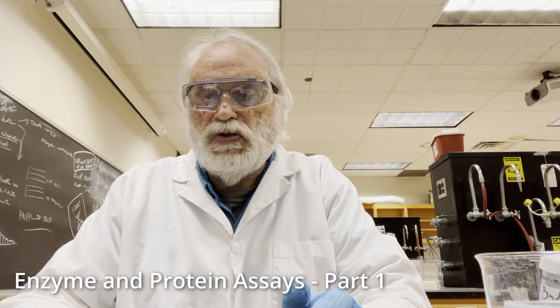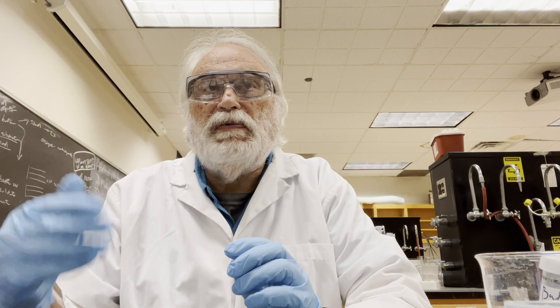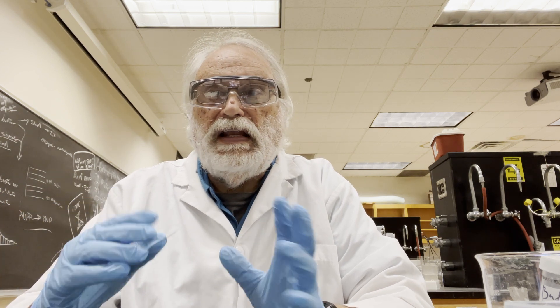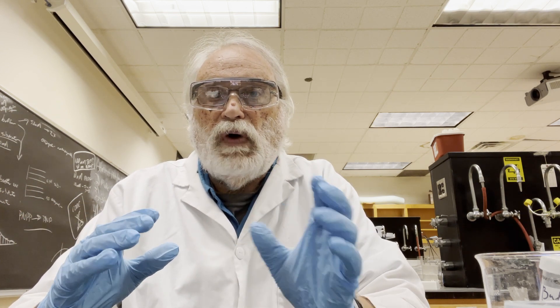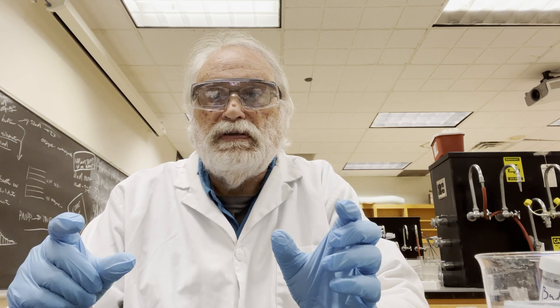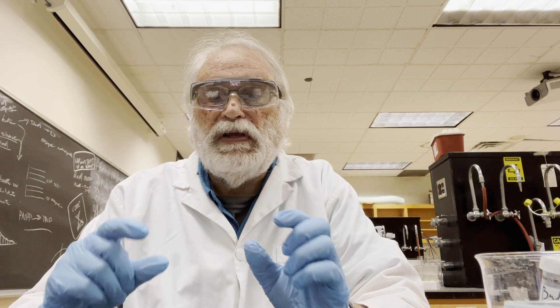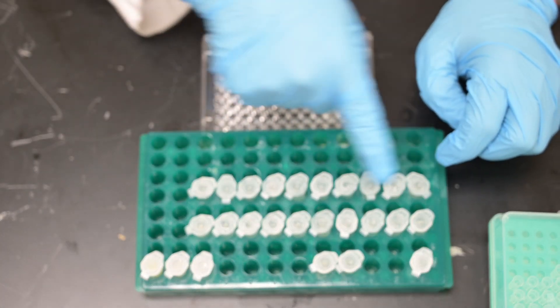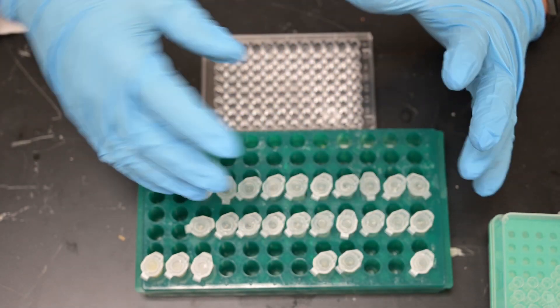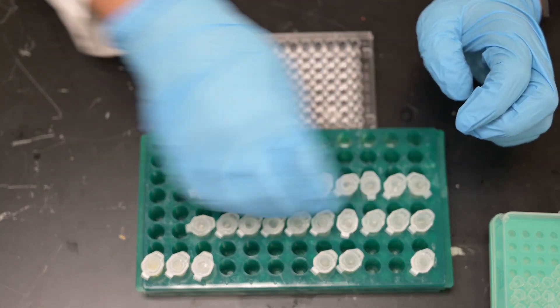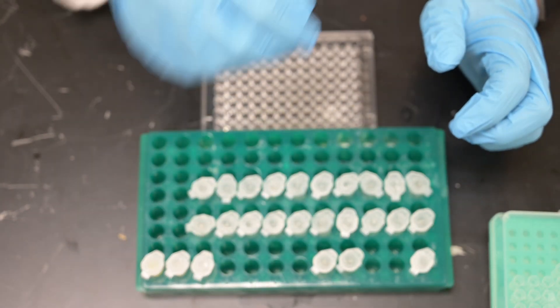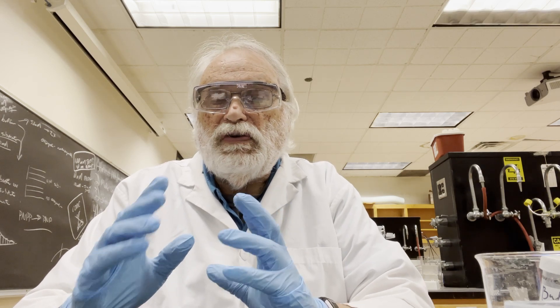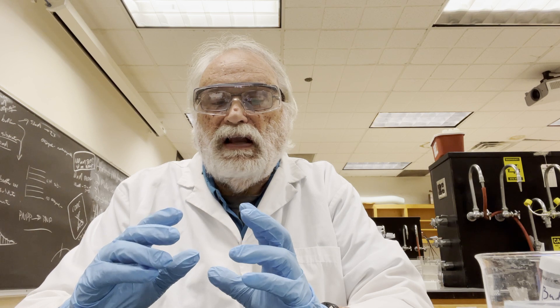Hey everyone, we've been working all semester towards creating a mutant and we're now starting the phase of the class where we're going to characterize the mutant. What we did last week was we took the wild type and the mutant and we isolated protein from them. We ran a DEAE column and generated a series of samples, all laid out here in the same order as on the plate map in the protocol. I want to do a quick review: we loaded the column with lysate.